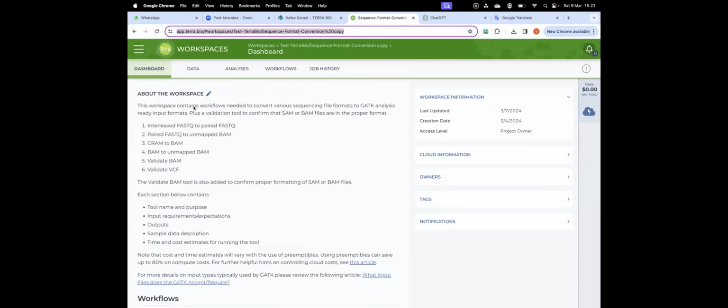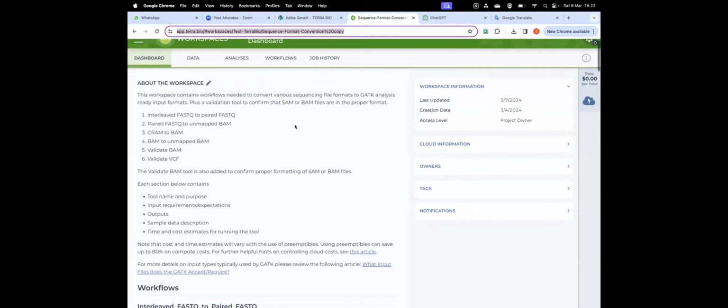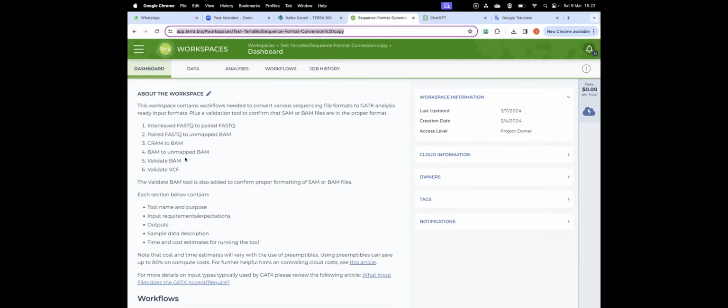We'll talk about format conversion. So as we know, we need to have VCF file to analyze the gene sequence. So we want to know how to convert from one file to another file. Okay, hopefully all you guys open the link and log in, and let's start.